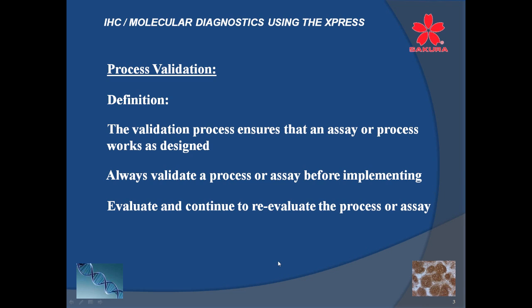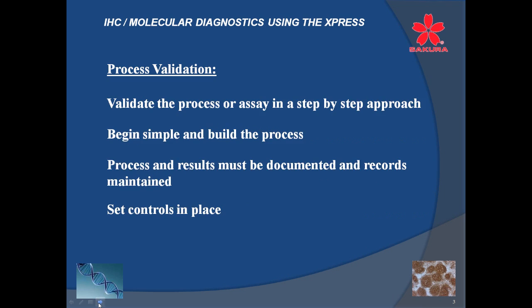Evaluate and continue to reevaluate the process or assay. So when you do the validation once, you may not have to do the entire process again, but it's an ongoing thing. It doesn't really stop. You do move forward with continuing to validate things as time moves on for anything that you're doing in IHC and or molecular.